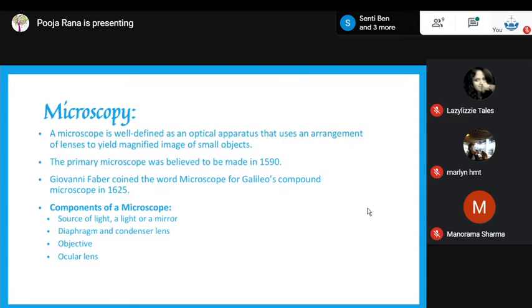As a result, the sample can be easily observed by the eye. Moreover, this particular instrument could be carried anywhere, and using the natural light which is available, you could put this particular instrument into use. So this was quite prevalent all over. And the image from an optical microscope can be taken by standard light sensitive cameras to produce a micrograph.